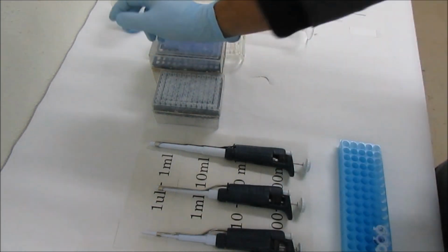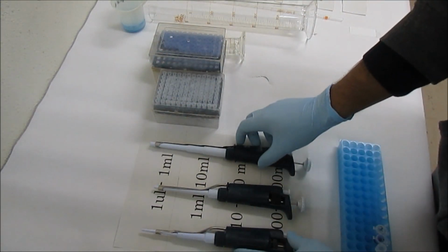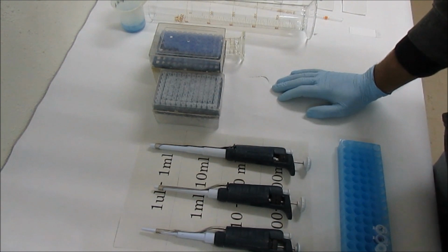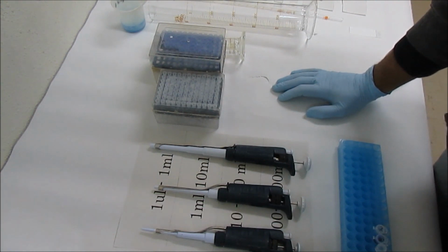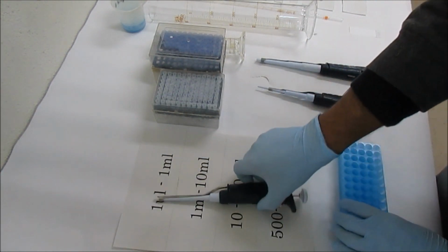Imagine if you start working in a research laboratory and you're supposed to deal with different liquids. You need to prepare media, you need to prepare buffer, and you need to prepare different reagents, right? It depends on how much volume you need.